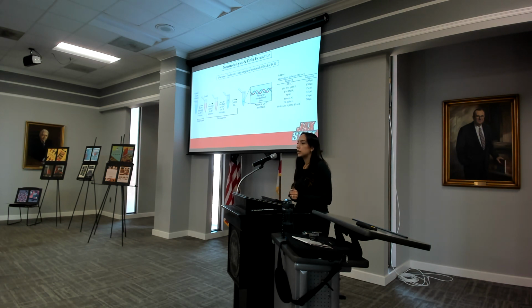Moving forward, a DNA extraction was carried out using nematode lysis solution. Approximately 20 to 25 nematodes were transferred to the solution, which was then put in a negative 80°C freezer overnight to assist in the freeze crack step, which essentially bursts open the cell membranes to liberate the DNA. And then it was run in a thermal cycler to assist in purifying the DNA sample and cleaning up any cellular debris surrounding the DNA, which, like I said, results in a purified DNA sample to be used for PCR.